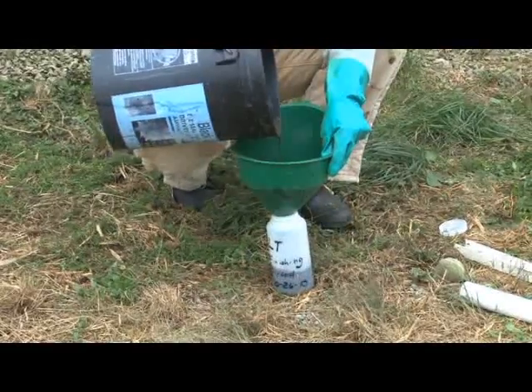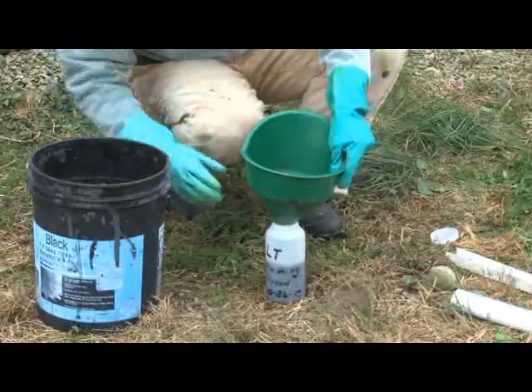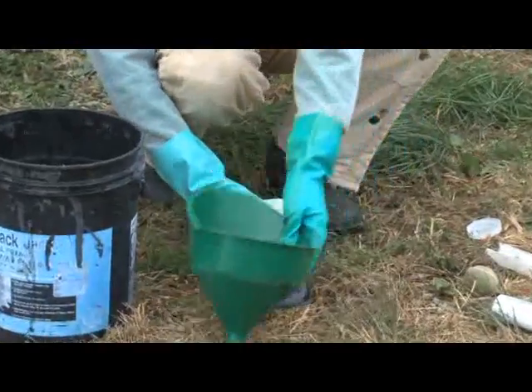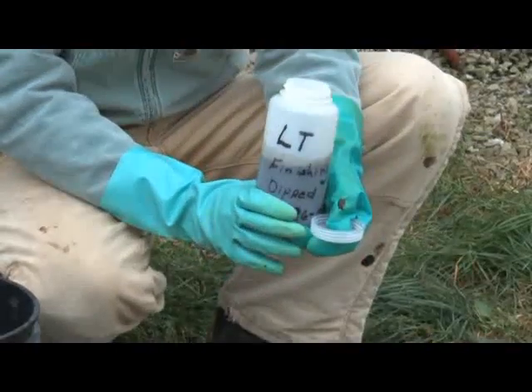The sample may be frozen before sending to the lab, so the extra space is needed for expansion. The sample should be frozen immediately and shipped frozen on a Monday or Tuesday, so it arrives at the lab for analysis during the week and not during the weekend.